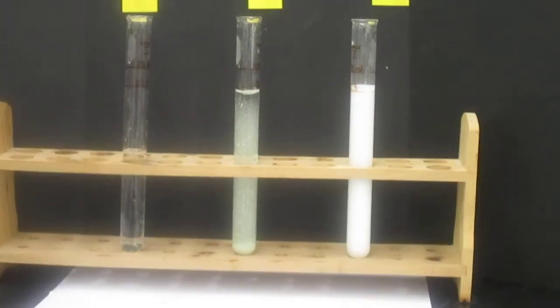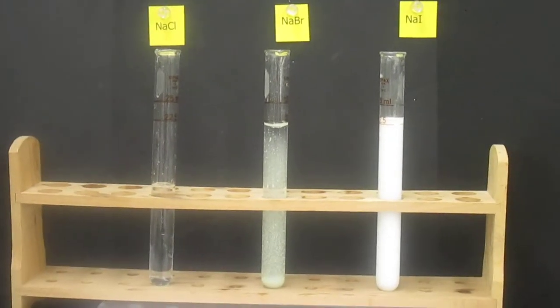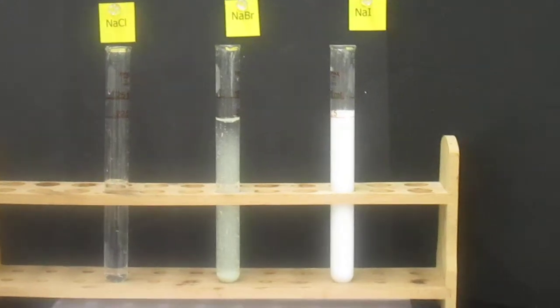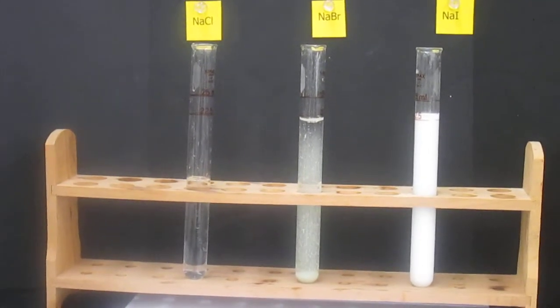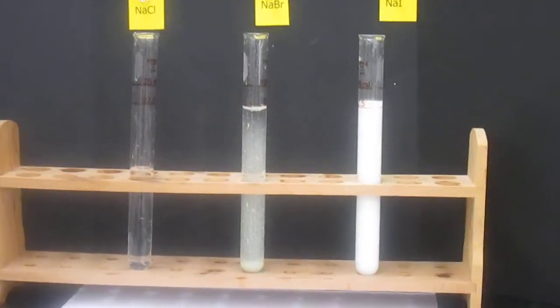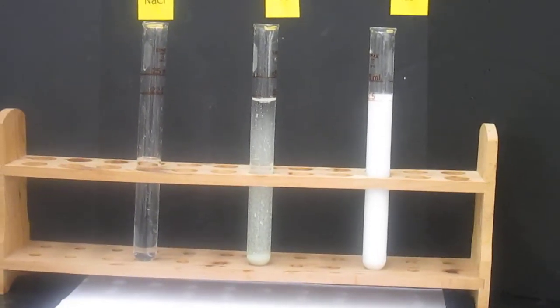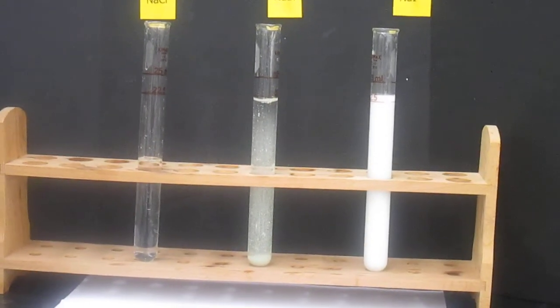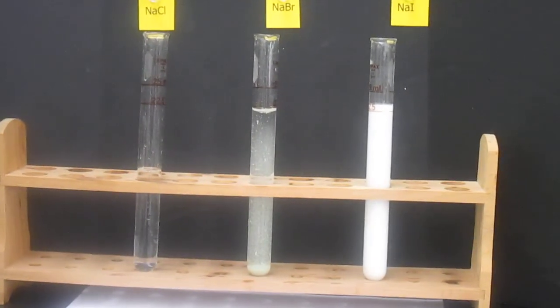So you can see the three progressions there. You have sodium chloride that is crystal clear now. We have sodium bromide in the middle one that we started with, and we've lost most of our precipitate. And lastly, we have sodium iodide, and we have not lost any of that precipitate. So write down your judgments as to whether they are soluble, slightly soluble, or completely insoluble.